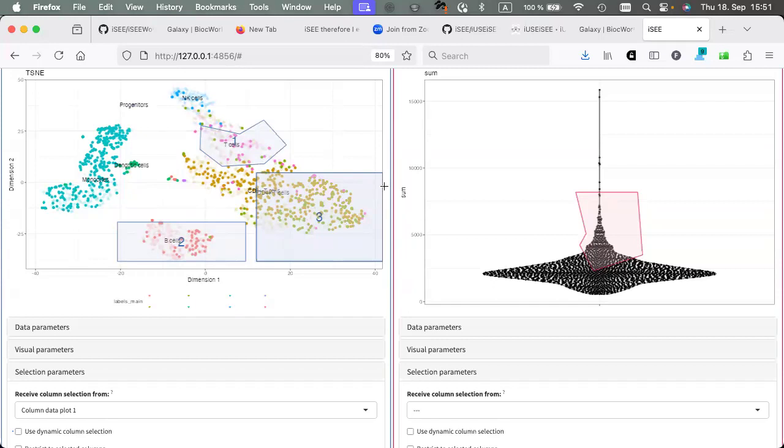But yeah, as long as the input object is there and your panel knows where to sniff that information, find the data. So metadata is a wild card: if there's no slot for it, stuff it in the metadata, teach the panel where to find it in the metadata, and then the world is your oyster, and you can have a panel do anything. But again, I'm sure you're going to close on that later on.